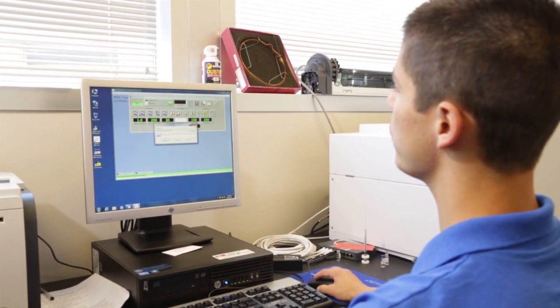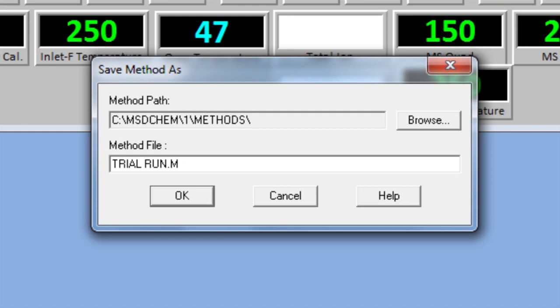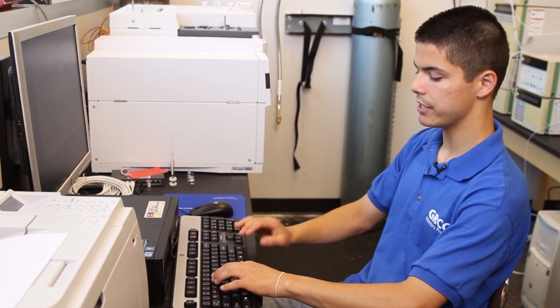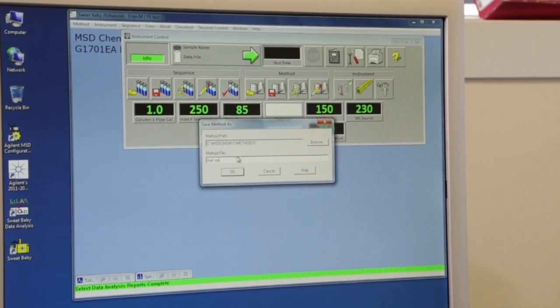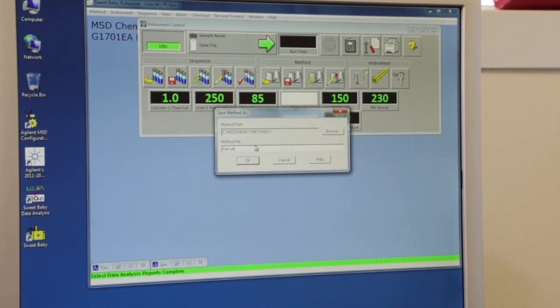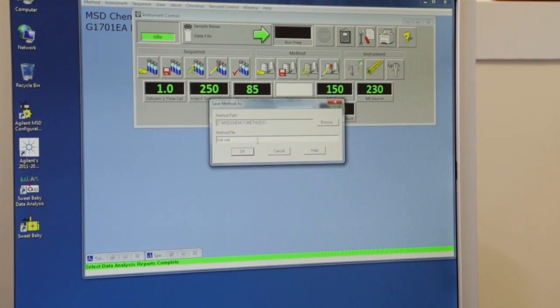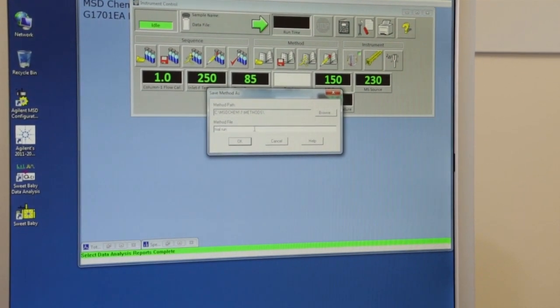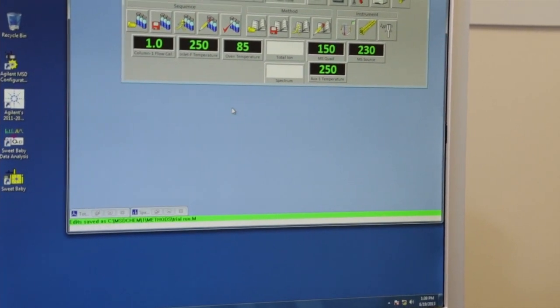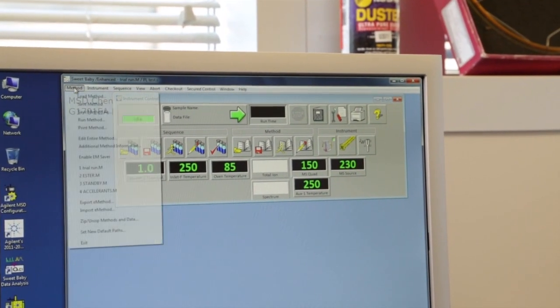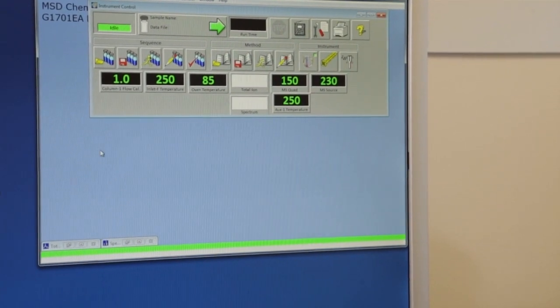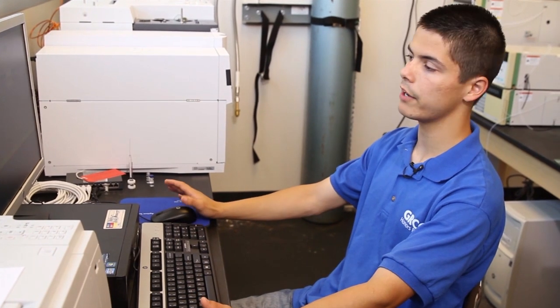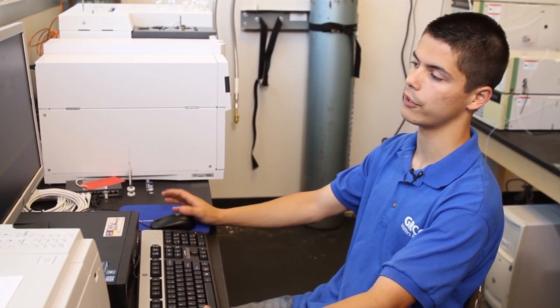You'll be prompted to give your method a name — I'll name it 'trial run.' Whenever you try to use this method again, that'll be the name it's under, so try to make a detailed name so you know exactly what the run is meant for. Hit OK and you've just created your method. Whenever you want to run a sample, you just load that method and you don't have to set up a new one again.